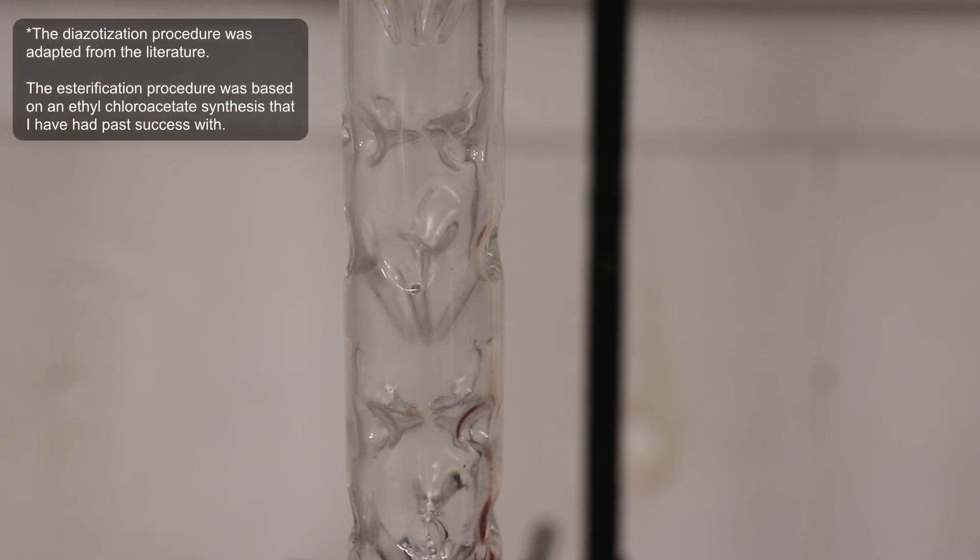As I followed a known literature procedure, and obtained a product that had the correct boiling point range, I would be confident in saying that I have successfully made ethyl-2-S-bromopropionate.